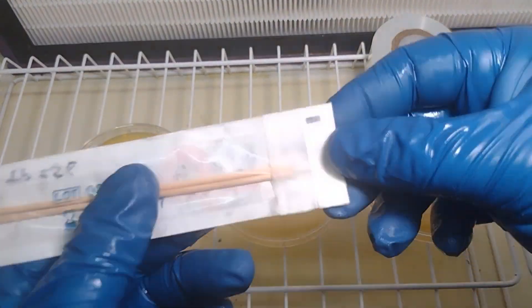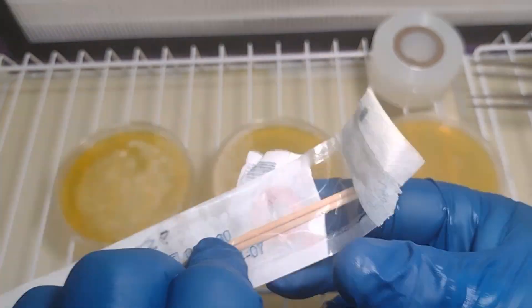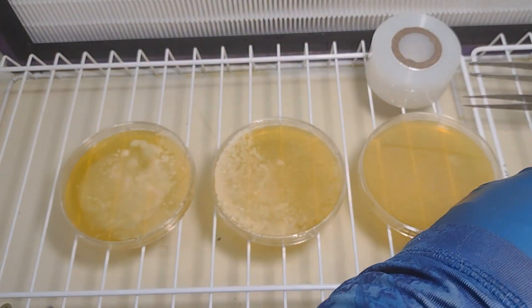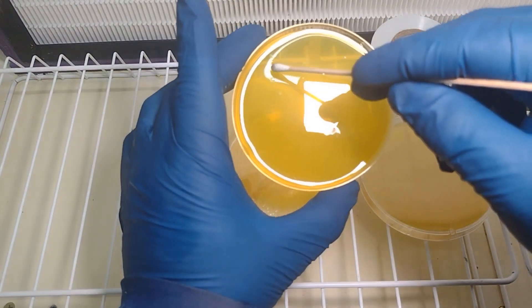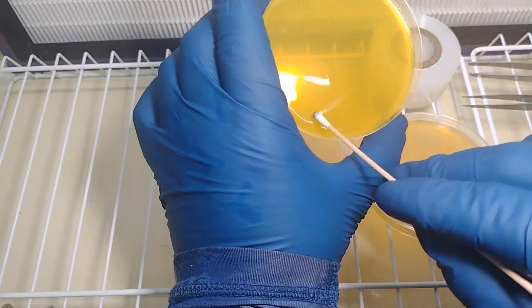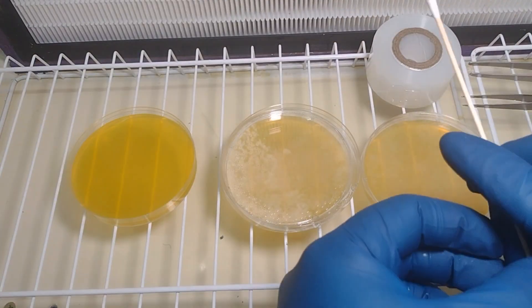Now I'm going to unpackage my spore swab. We want to make sure that we're pulling from the farthest side away from the cotton tips. For this first one, I'm going to be doing a square-like pattern. Each line will give us less and less spores, and hopefully less and less contamination. We'll just follow the growth and see how it goes.